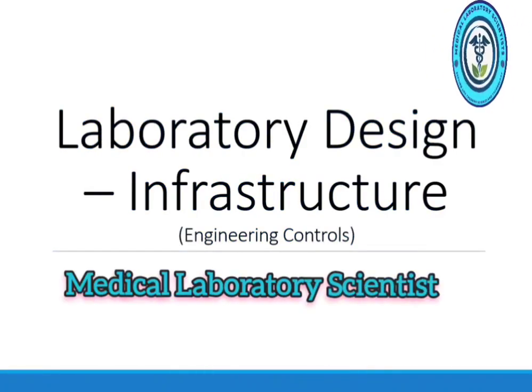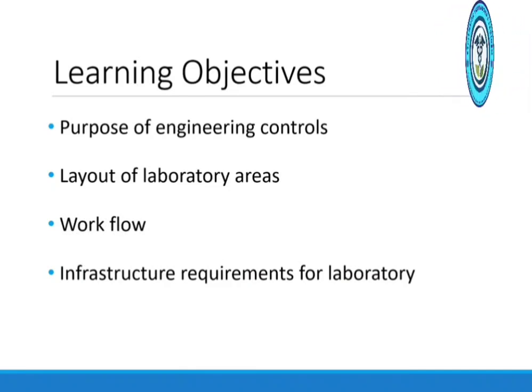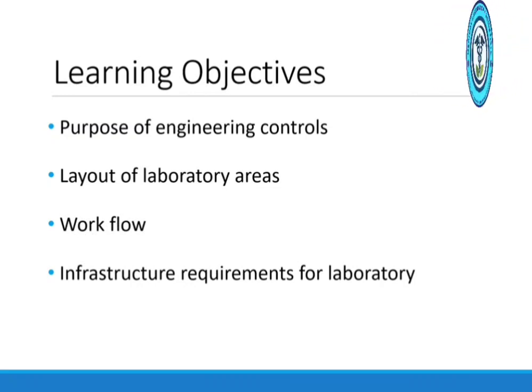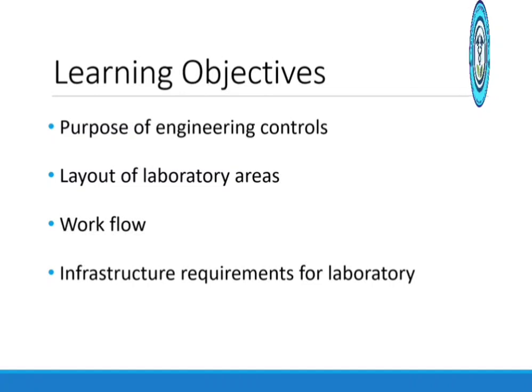Laboratory design in terms of infrastructure or engineering controls. The term engineering controls covers a broad spectrum of possible interventions that are intended to physically reduce worker exposure and protect workers from hazardous conditions. The learning objectives include the purpose of engineering controls, layout of laboratory areas, workflow in a laboratory, and the infrastructure requirements for a laboratory.